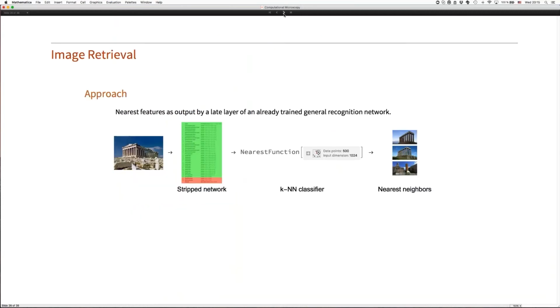Okay, so that was image identify. Now some other example quickly that may relate very well to microscopy, because when you do microscopy, you generate images, and usually you generate a large amount of images. And if you don't tag these images with respect to their content, you may have a hard time retrieving images, finding images that may resemble the current specimen that you have under your microscope. So a possible scenario may be that you want to do image retrieval.